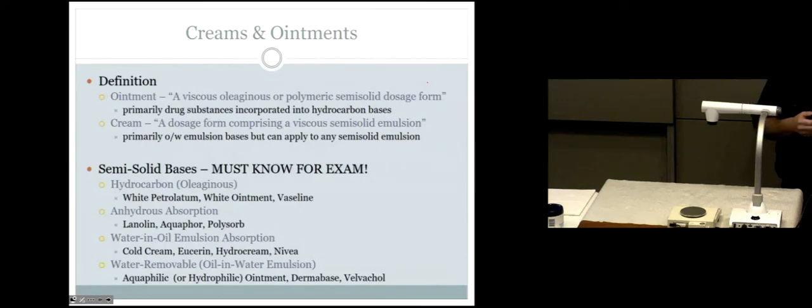It's the same idea. But because this is a new week, we're going to make you memorize a new term. Don't ask me why, but there's a special term that we use for wetting powders when you incorporate them into topical creams or ointments. So you guys know what it is? Levigate. When we talk about levigating, you are going to have to use the term levigate in your procedure. What does levigate mean? Wet the powder. Basically liquefy the powder so it can be dispersed into the semi-solid base without forming clumps.